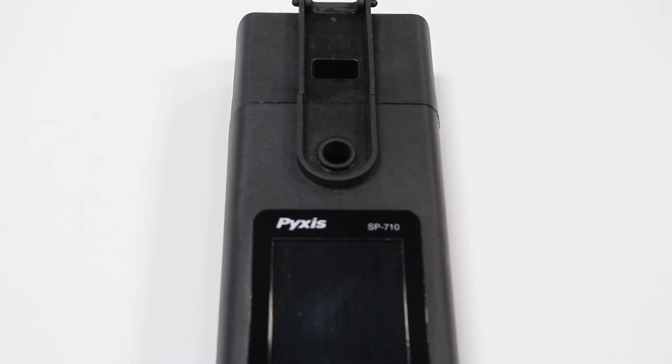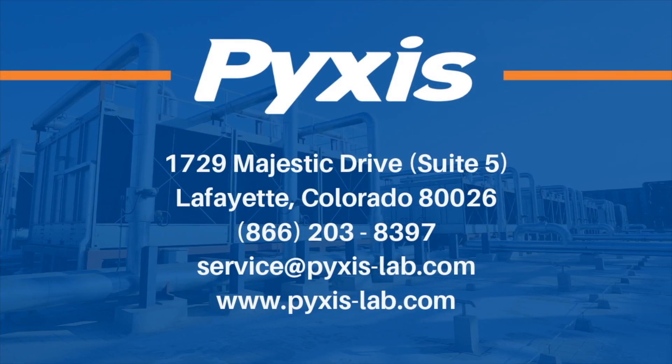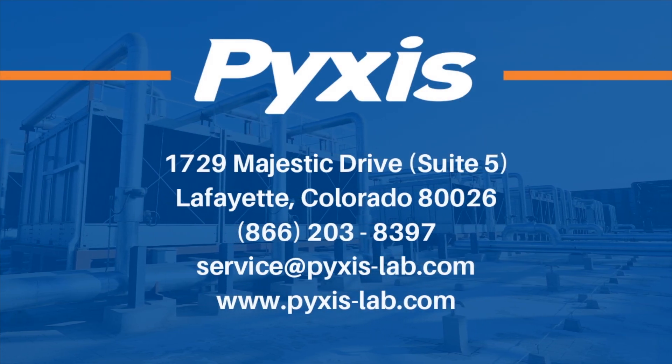Your SP-710 or 710B is now clean and ready to be calibrated. Thank you.